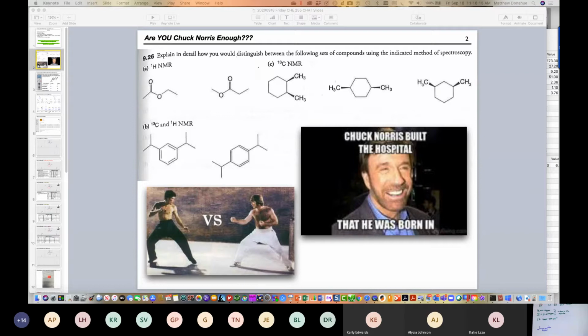Let me just repeat that. There's some responses in the chat box about symmetry, and in this course, we're just going to consider the development of chemical intuition. We're not looking at hardcore math, so there is symmetry. Symmetry is usually the easiest thing to think of as a mirror plane. So here's the molecule. If I draw a mirror plane, which I'm going to do in a dotted line, consider this red dotted line is a plane perpendicular to the sheet.